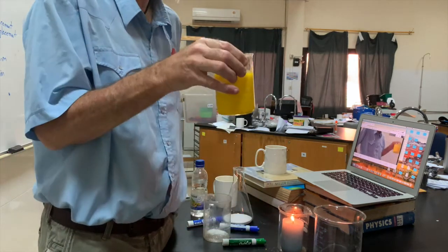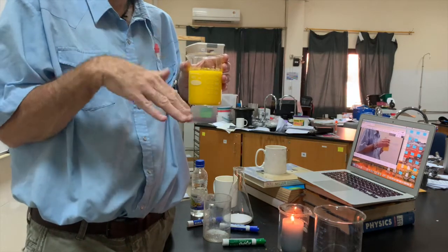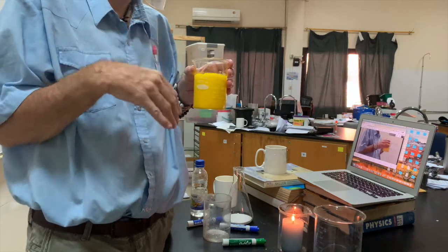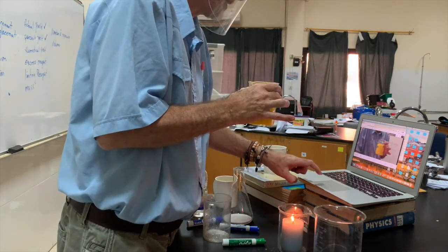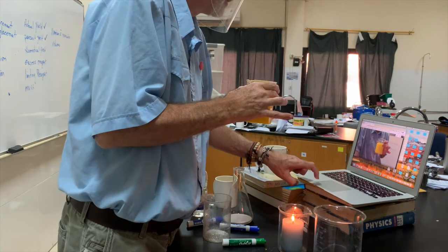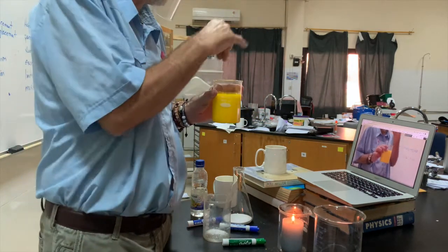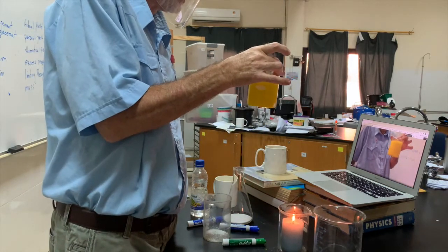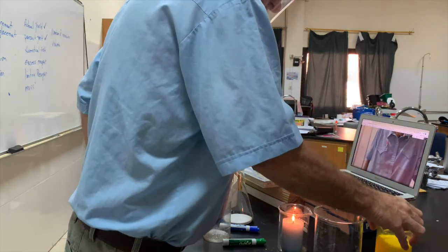And I'm going to let that down, and you're going to see the beginnings of that settling. Yes, it's a fine powder, but it formed. It's a fine powder. You guys at home can see it? Okay, I'm taping this through an iPhone. The other thing is just worthless. All right, so I'll show you that again in a minute, and you'll see things are settling, okay?